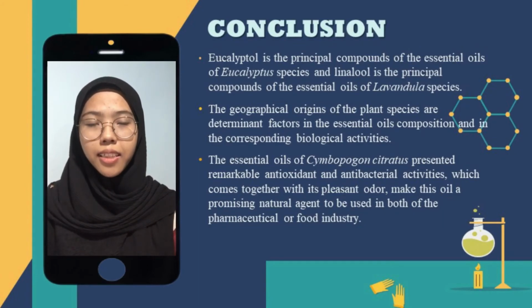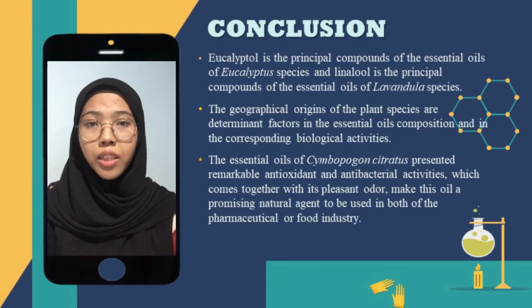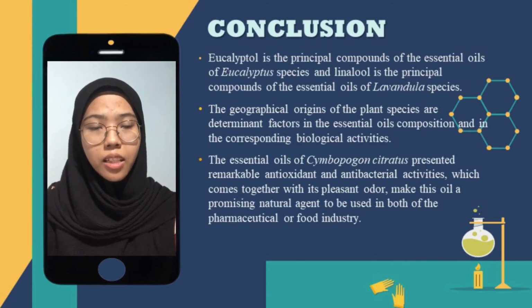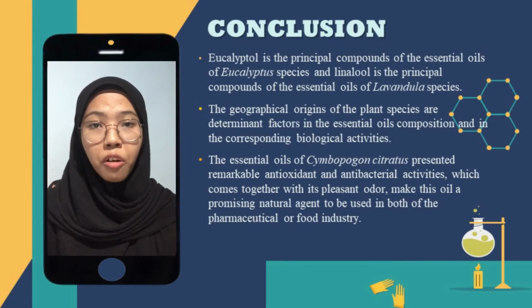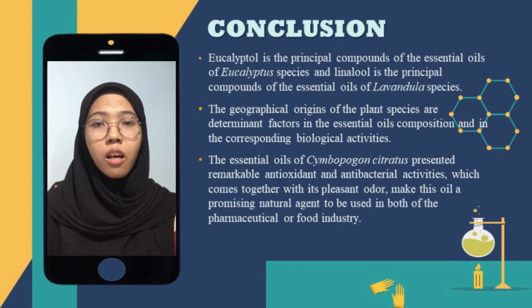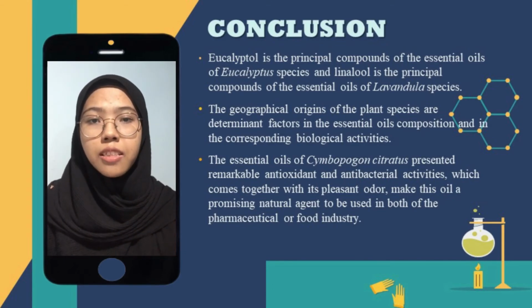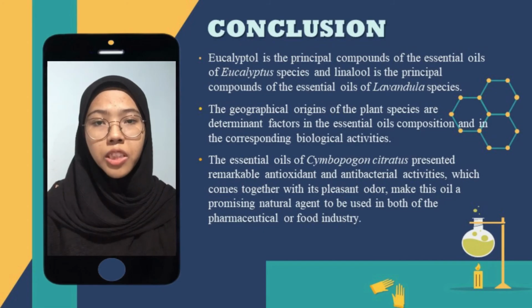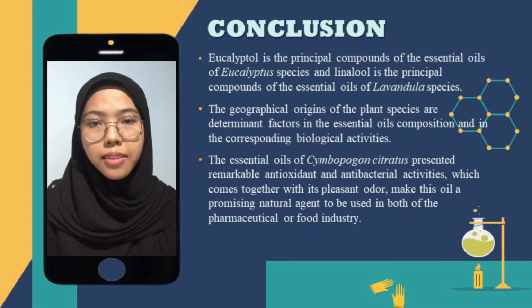In conclusion, eucalyptol is the principal compound of the essential oils of eucalyptus species, and linalool is the principal compound of the essential oils of lavandula species. The geographical origins of the plant species are determinant factors in the essential oil compositions and in the corresponding biological activities.